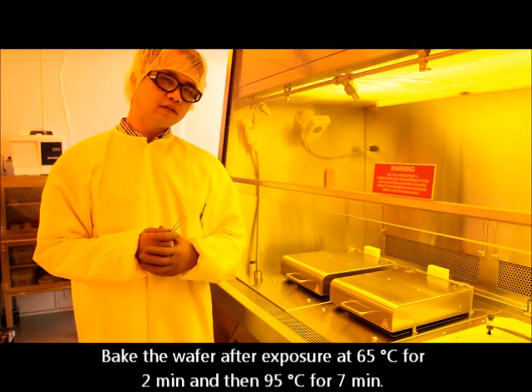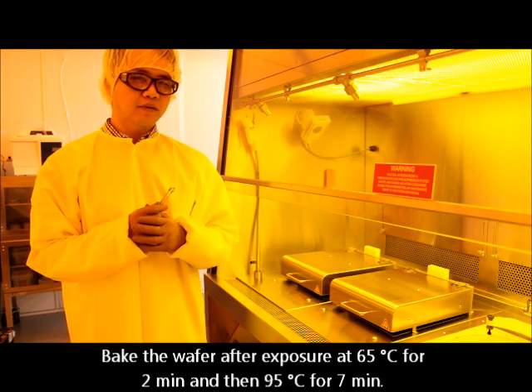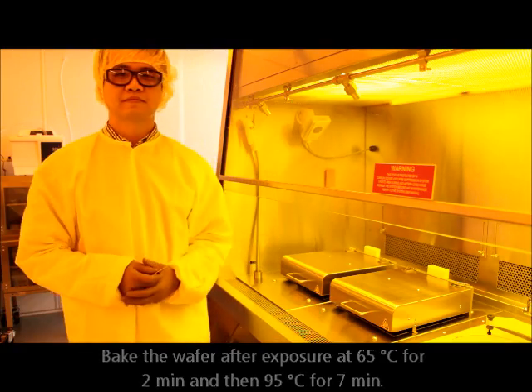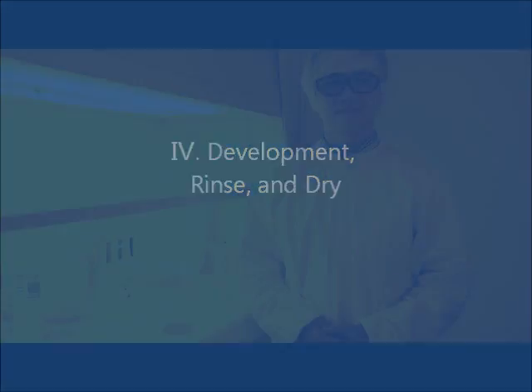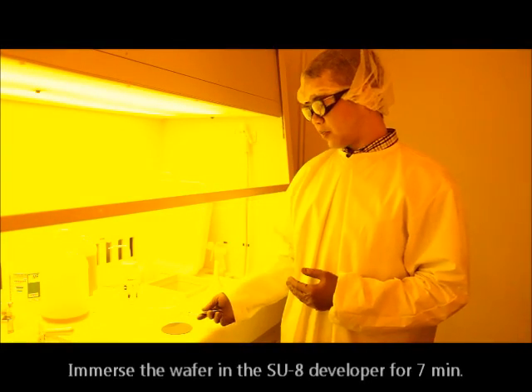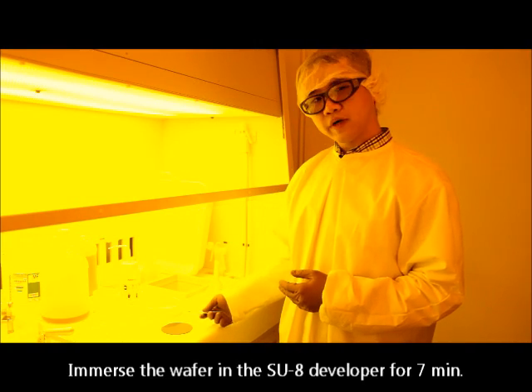After UV patterning, we conduct a post-bake process at two steps: 65 and 90 degrees Celsius. After the post-bake process, we will develop this photo-resist by immersing it in the SU-8 developer.